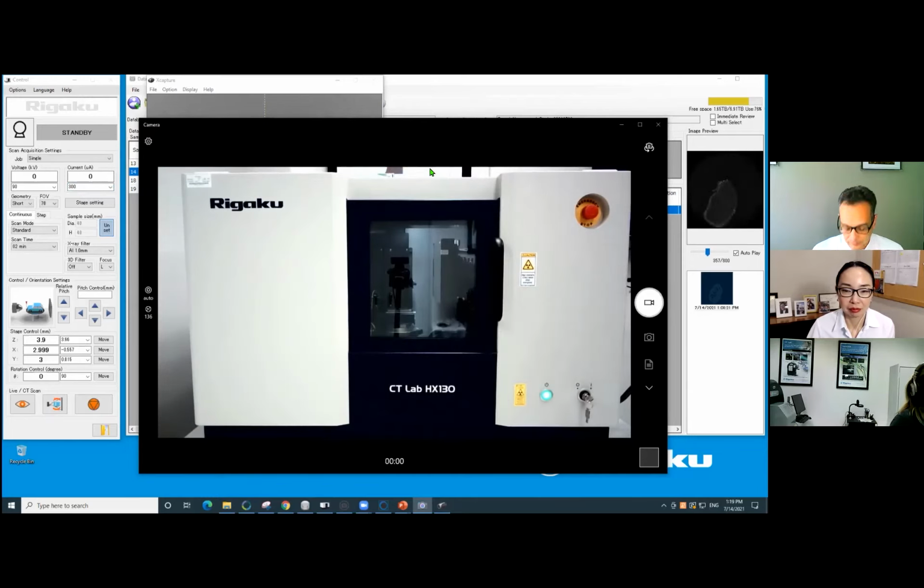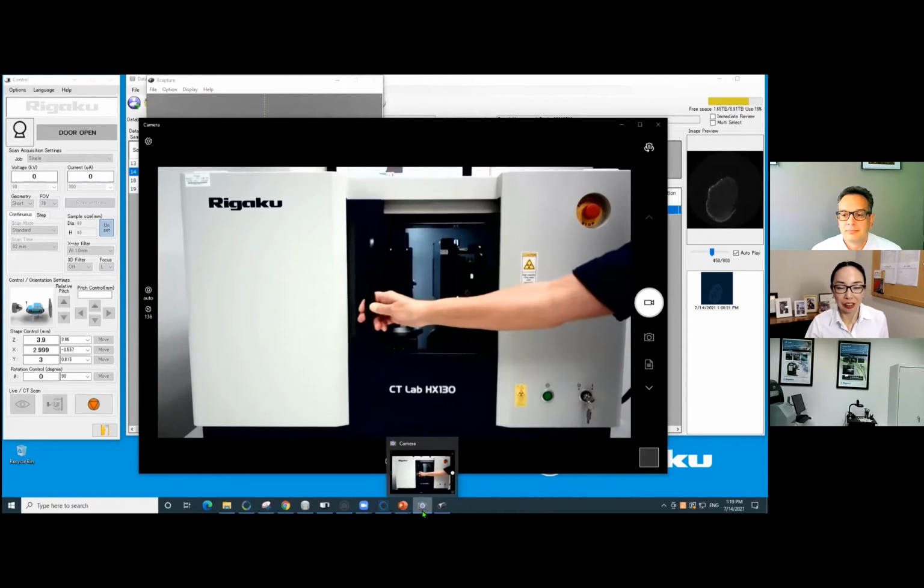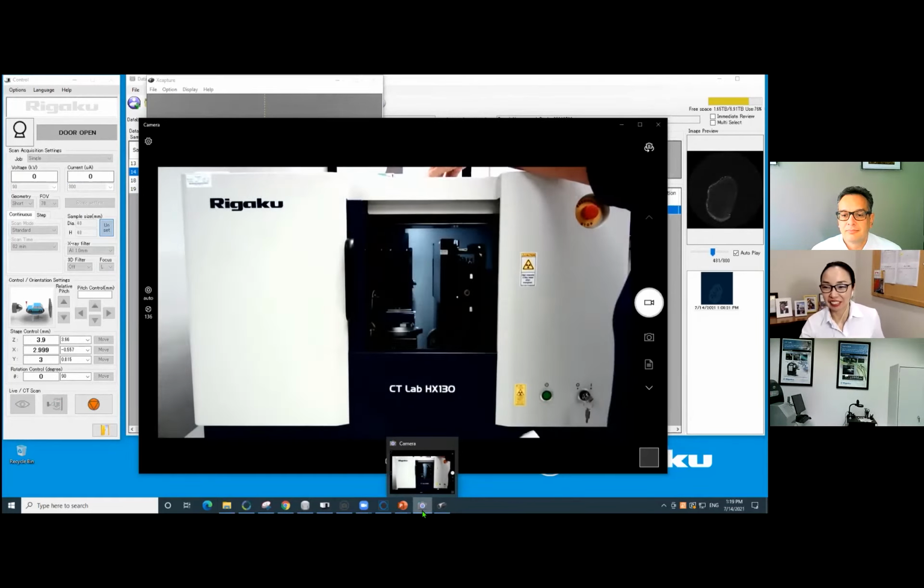The great thing about micro CT is it's a non-destructive technology, so we can actually take a look at it without even opening it, right? That's what we're going to do. In this case, you scan them all and then pick the one that has candy and eat it, right? That's what you want.